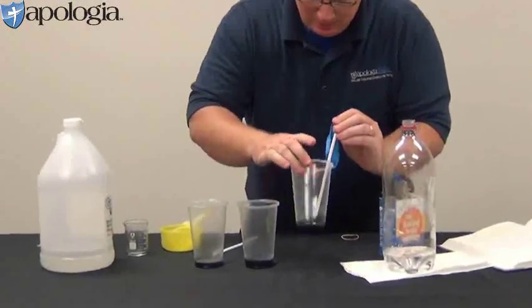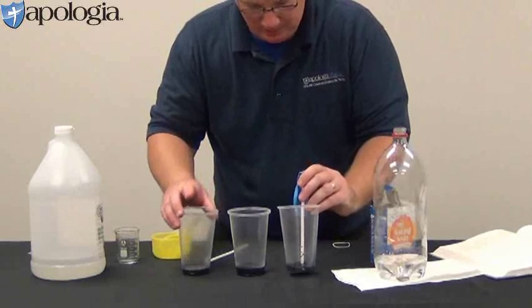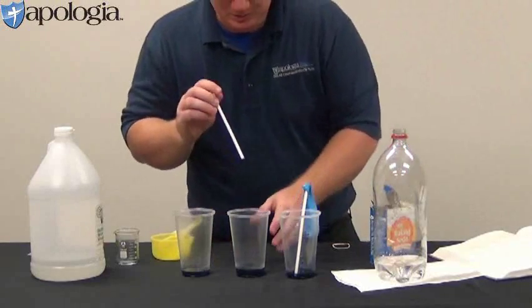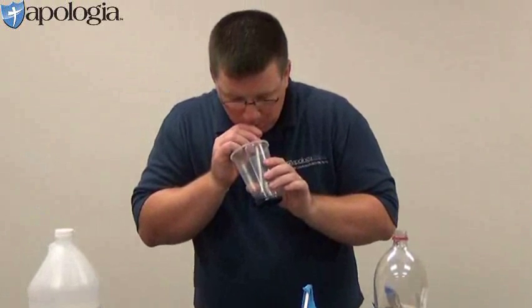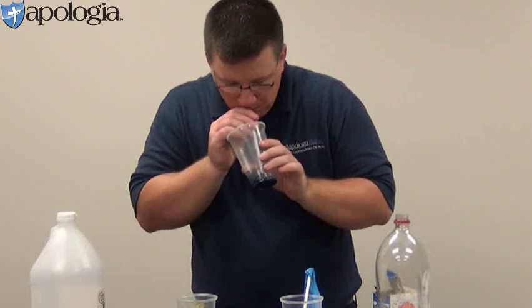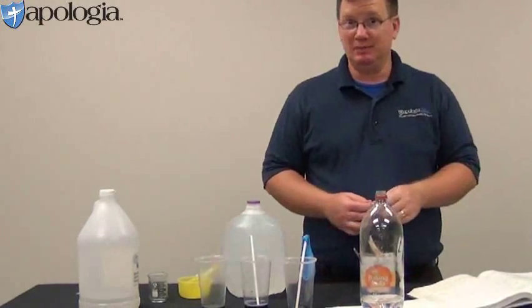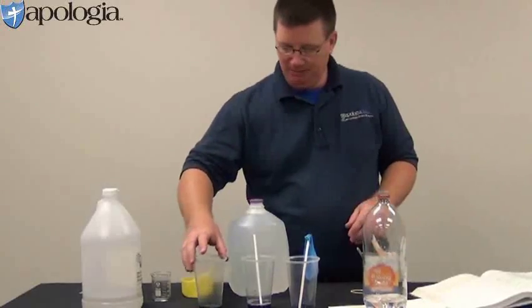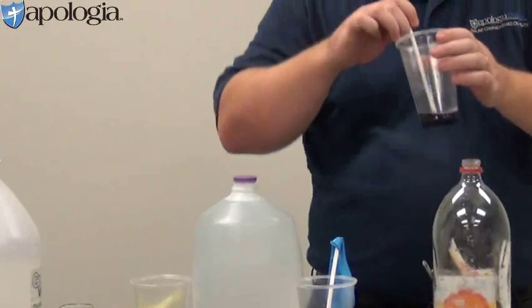Okay. And then compare that. Now, on this one, we're going to do the same thing, but with your mouth. Something didn't go right, and that's okay. That oftentimes happens. So now we're going to have to see what we can do. Here was the original control color, okay? And after several minutes of blowing in this, I finally got it to turn the red color that it needs to go, okay?